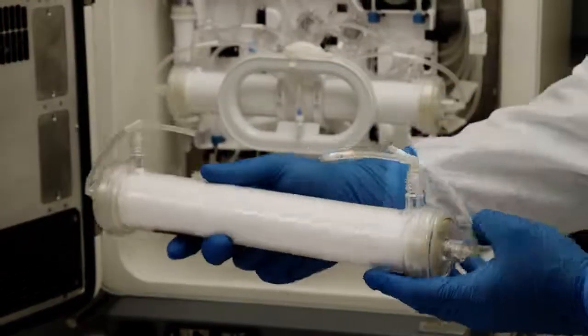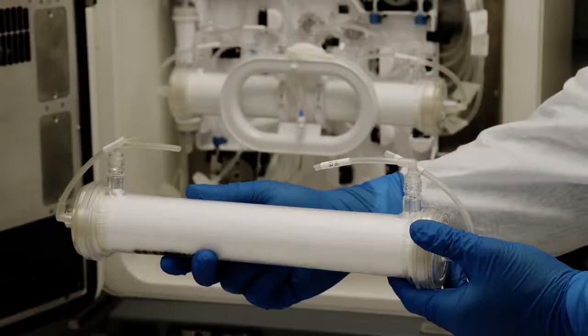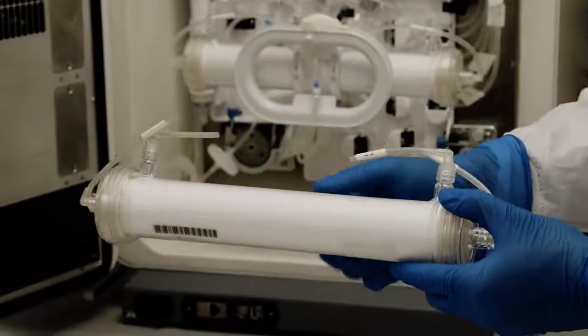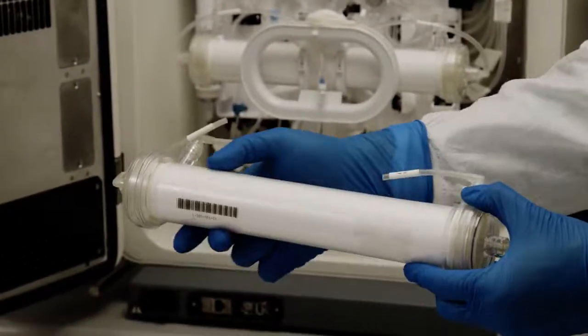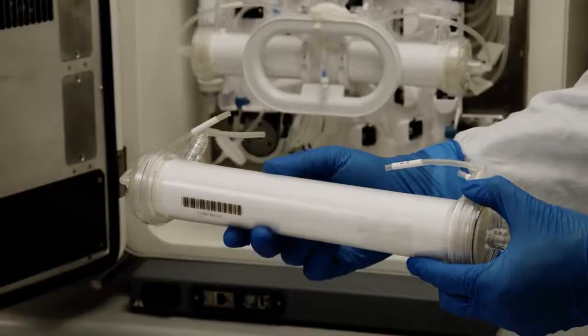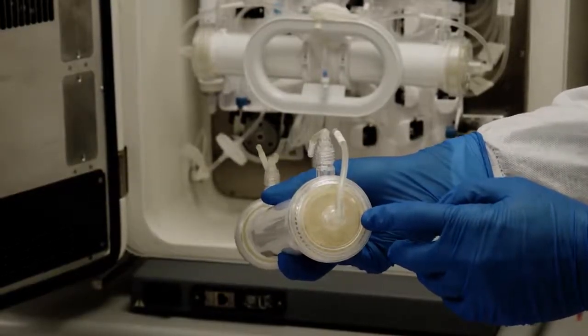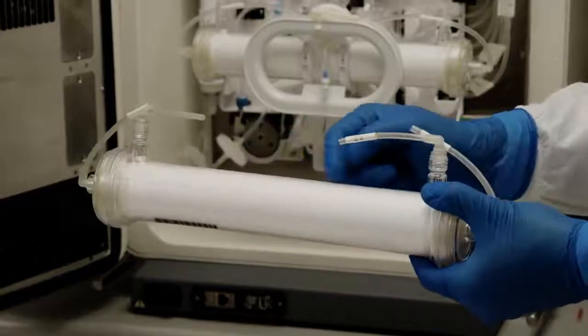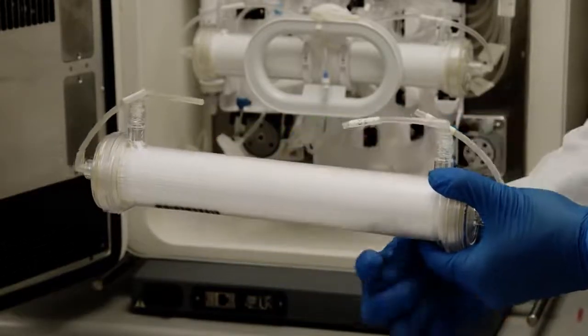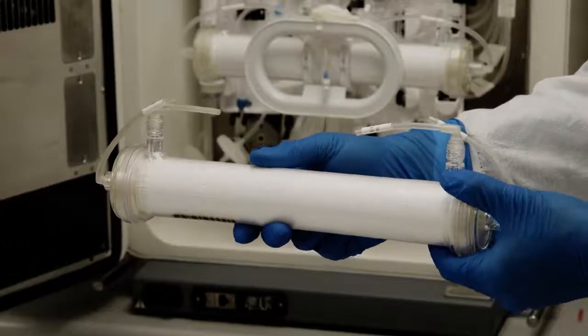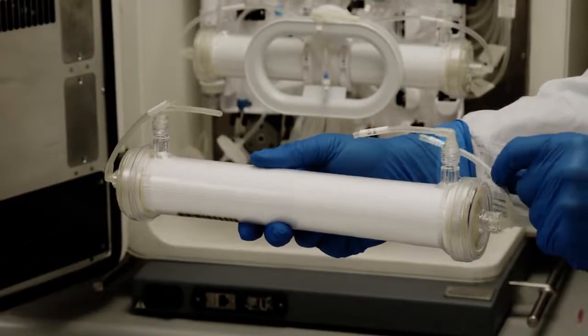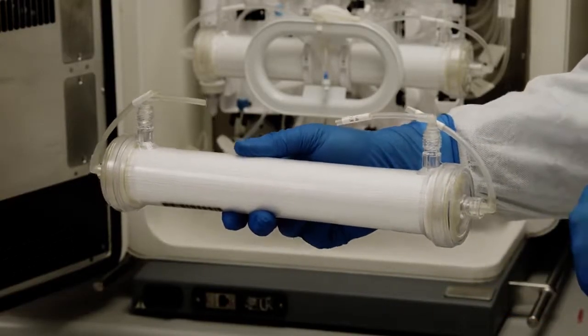Think of it like a Pringles can turned on its side, packed with 11,500 semi-permeable fibers or straws. There are two separate environments here: an IC or intracapillary space inside those hollow fibers, and an EC or extracapillary space surrounding those hollow fibers. This enables us to use two different reagents and individually control those fluid flow rates as well.